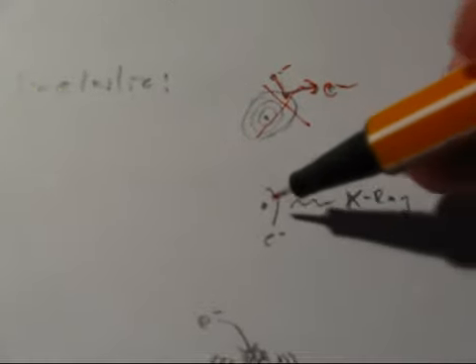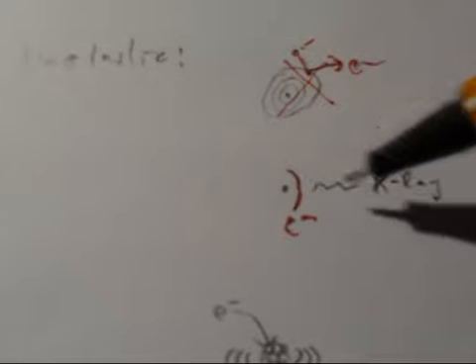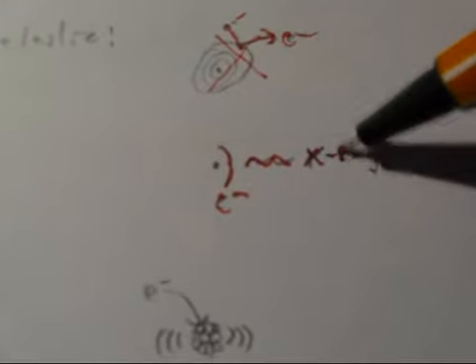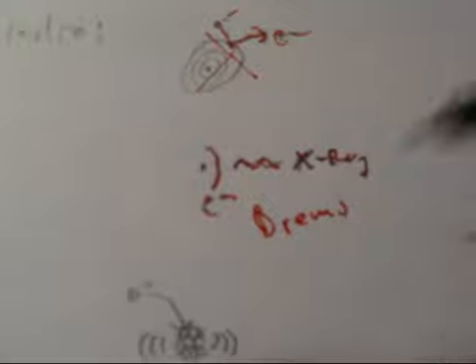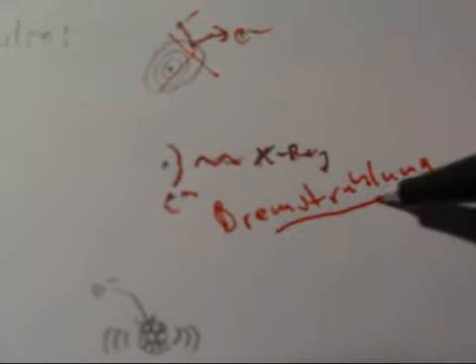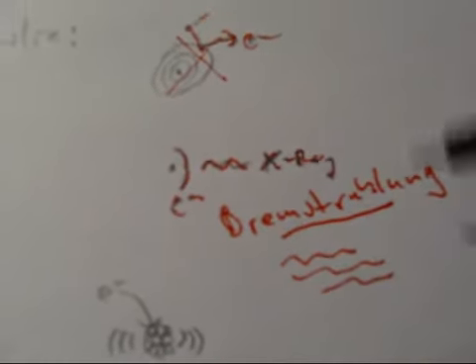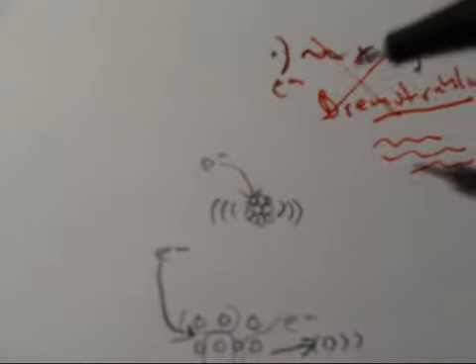And we actually may get Bremsstrahlung, where the electron from our electron beam loses energy, and that energy, as energy is never lost, it just gets transferred to something else, actually becomes an X-ray, a Bremsstrahlung X-ray. You can actually look for my videos about Bremsstrahlung if you just search for this word within my videos. But that is a continuous spectrum, so it may have all different wavelengths, and that is really, really useless. You cannot analyze anything from that, so let's move on.